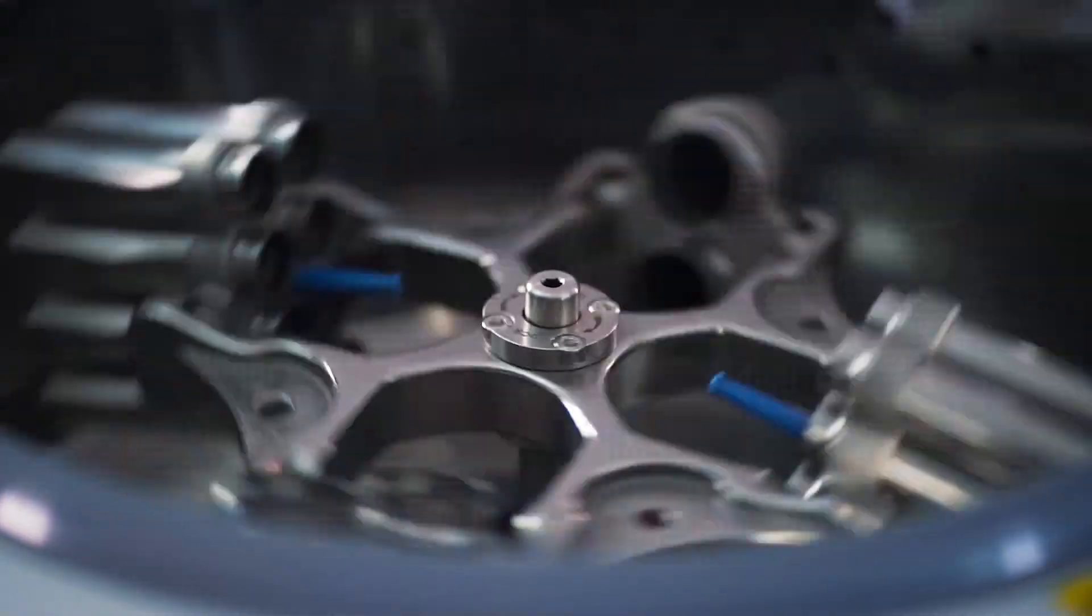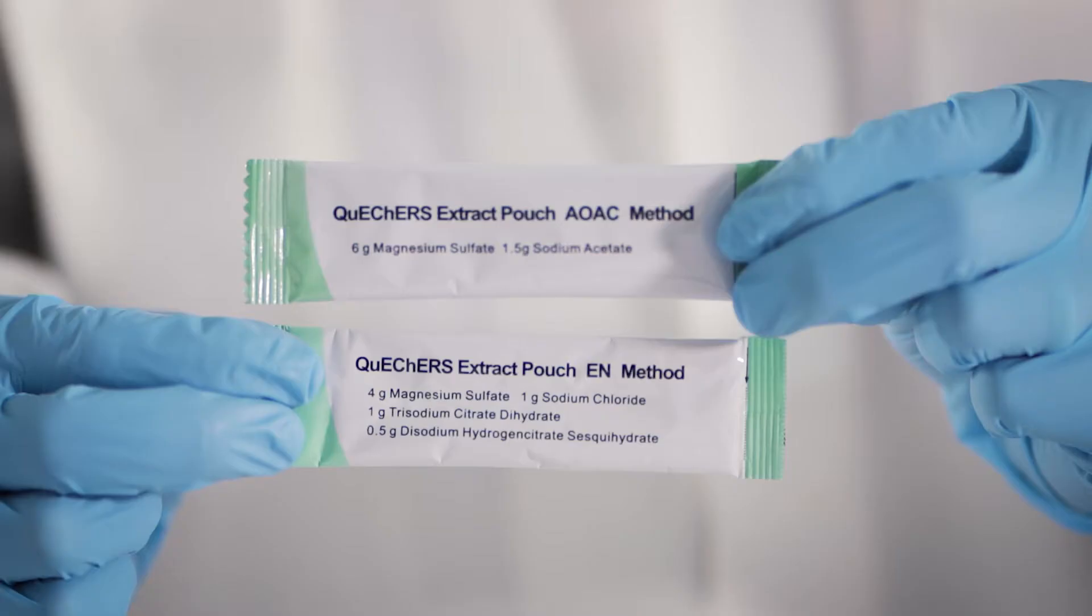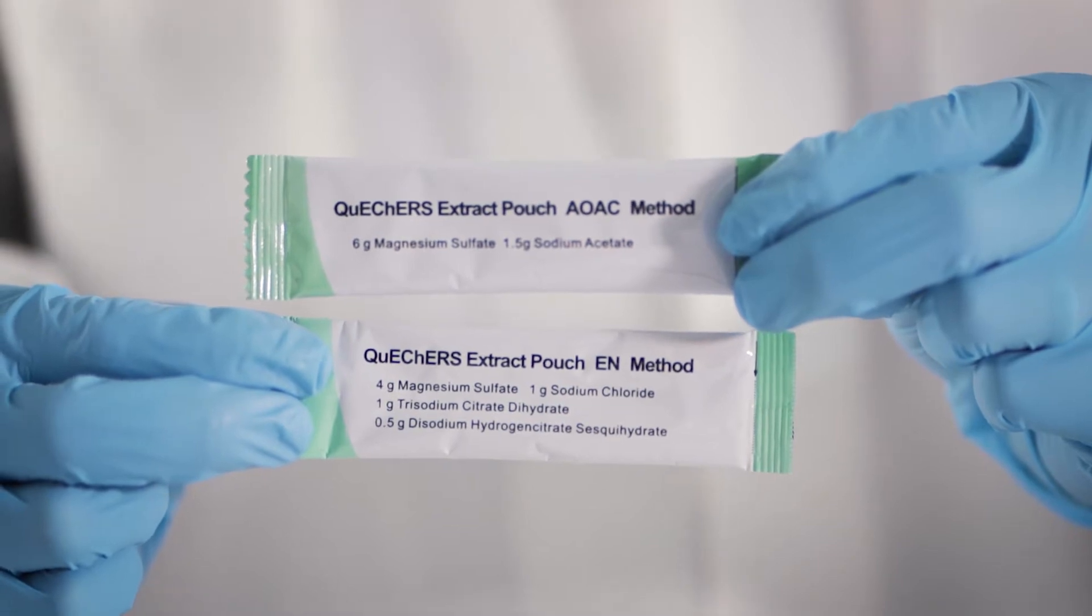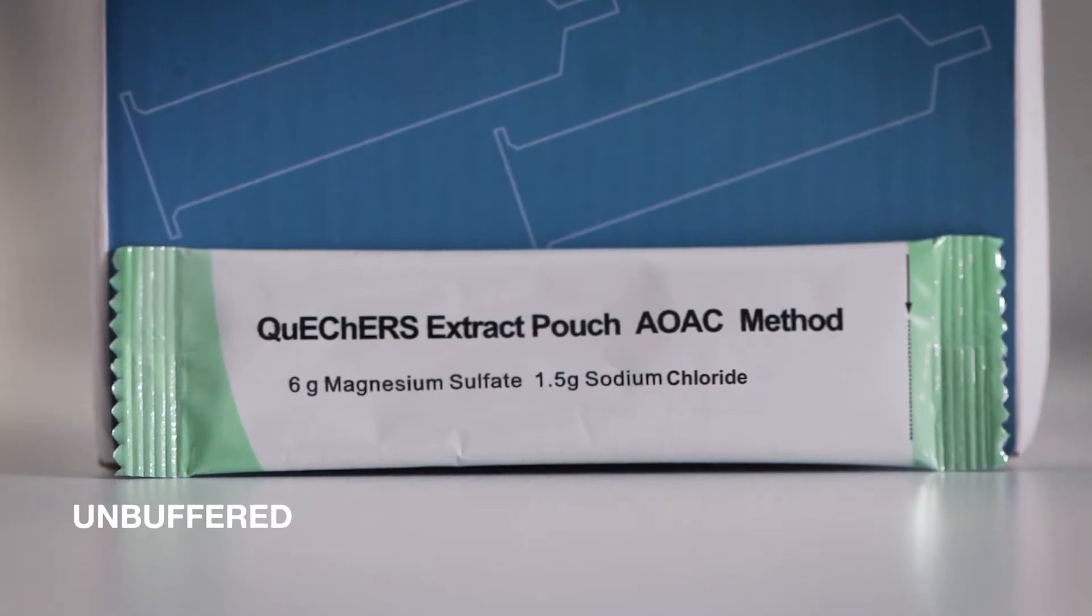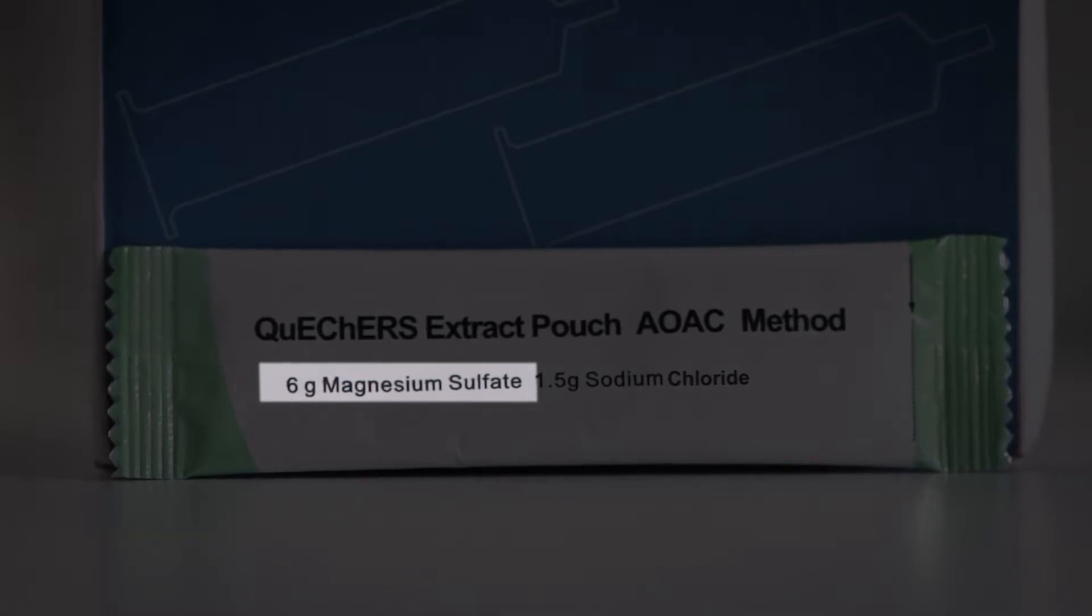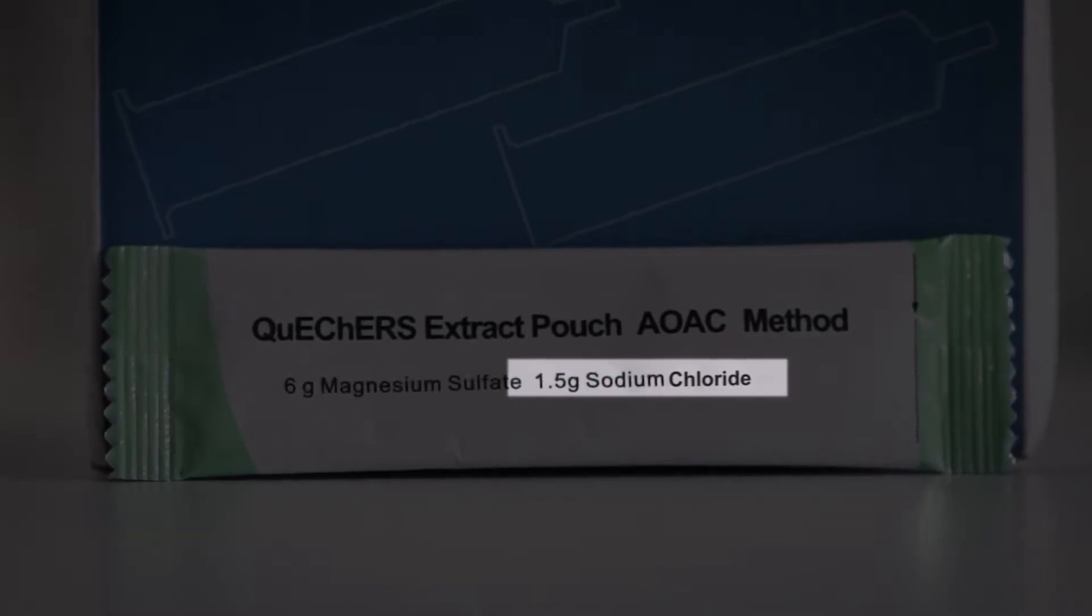Let's talk about these QuEChERS salts. The AOAC method has an unbuffered and buffered version. Unbuffered version is 6 grams of magnesium sulfate and 1.5 grams of sodium chloride. The buffered version, instead of the sodium chloride, you're using sodium acetate.